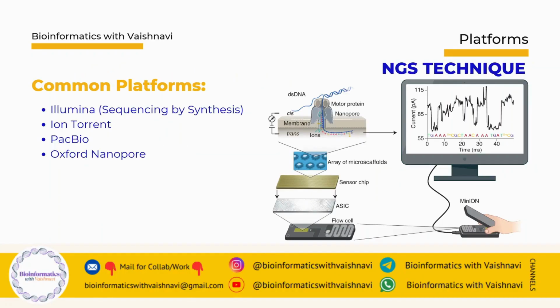So, common NGS platforms, there are several. The most common are Illumina, which uses sequencing by synthesis, Ion Torrent, PacBio, and Oxford Nanopore. Each platform has its own advantages and applications, which we will discuss in future videos soon.